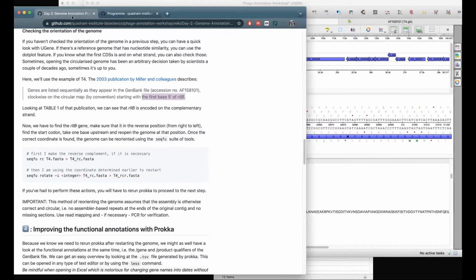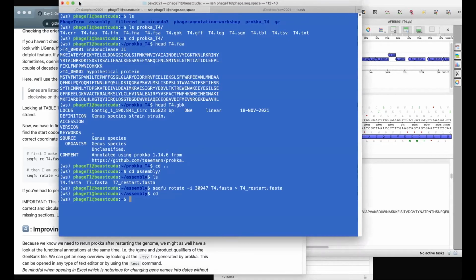I think that's a yes. So what did we do? And Andrew makes a good point that the consistent ends are important because it helps with comparative genomic analysis, and it does make your plots look a lot prettier as well.